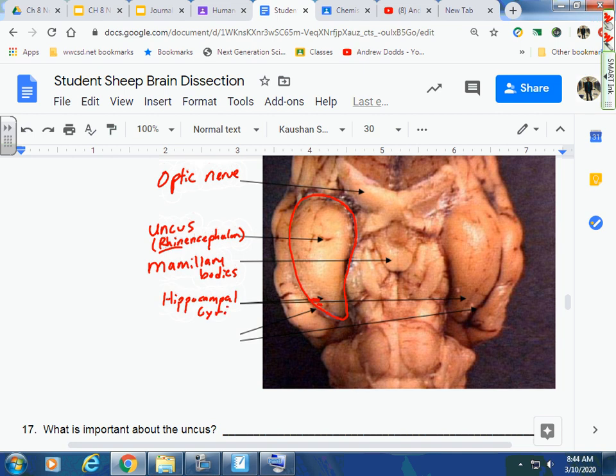So when you make the frontal cuts at the end, when you come through this section, we're going to try to see that area, which is known as the hippocampus, which is a pretty important thing too, which I ask about here in a second. And then they call this fissure along here, along the outside, the rhinal fissure.